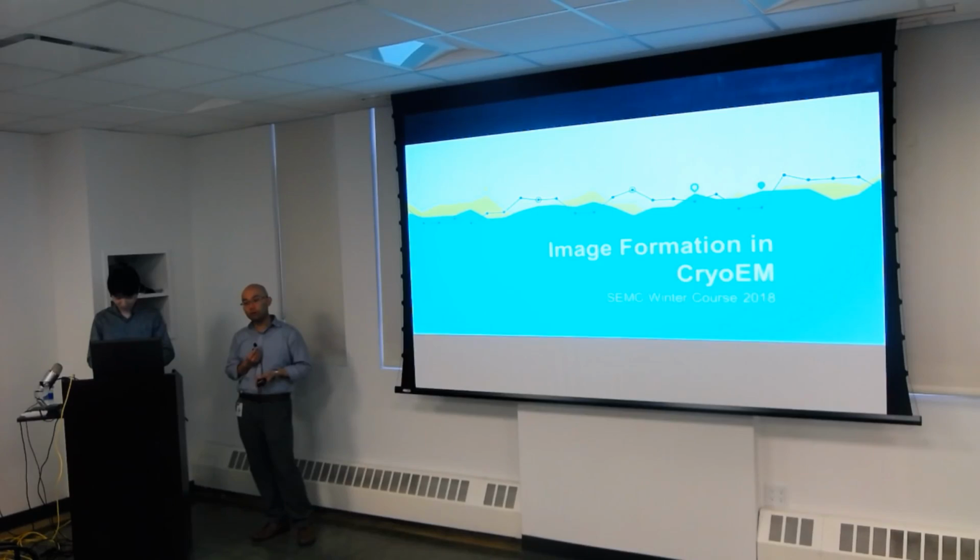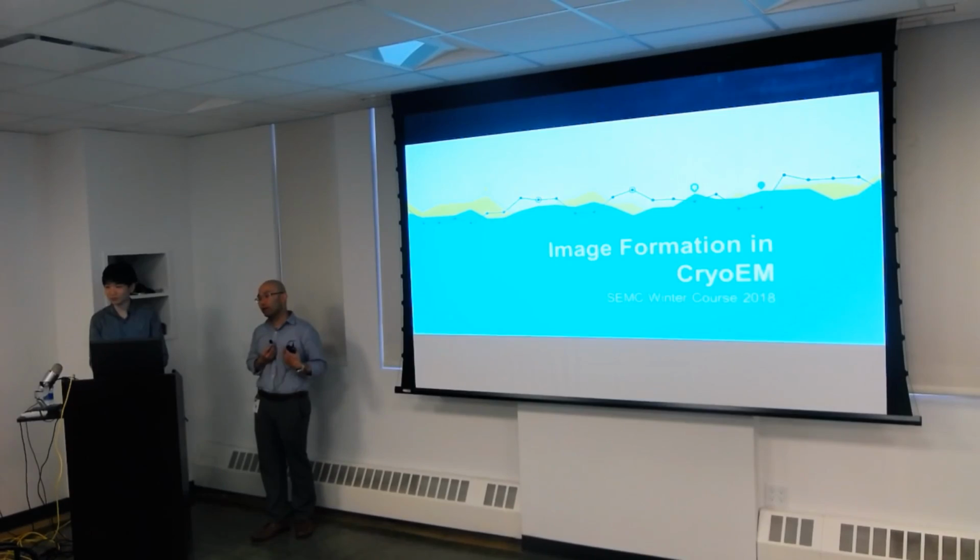Okay, so today we're going to be rounding out our fundamental section. And this is a very important section. It'll be a little bit more conceptual today, but the idea is that after this month, a lot of what you'll see and hear about in the later part of the workshop already assumes that you have certain basics, like you know what an FFT is, you know about a microscope, you know, especially very topical, image formation, the CTF, and other effects.